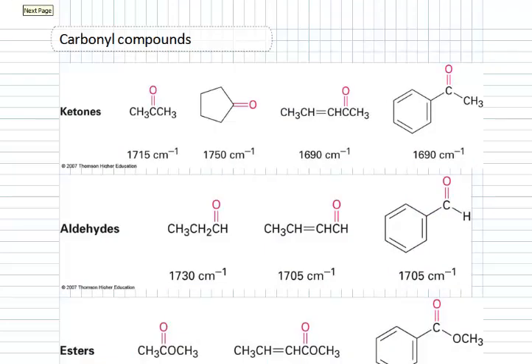Carbonyls, like I mentioned before, are very characteristic key pieces of important information we can get from an infrared spectrum. Our baseline will be acetone. This is characteristic of any normal aliphatic carbonyl compound.